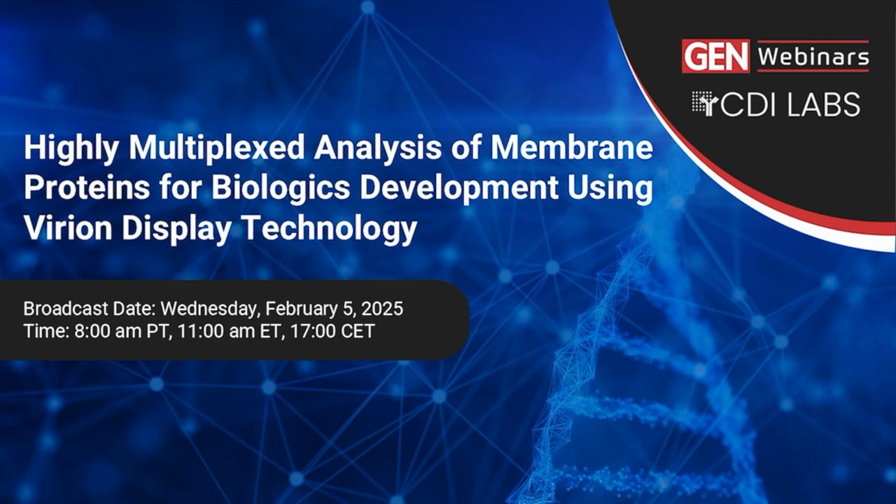Current technologies for studying membrane proteins either involve expression in cell-based systems, which can lead to high background from contaminating endogenous proteins, or purification using detergents or nanodiscs. In both cases, these approaches can result in receptor inactivation. So in this webinar, our speaker will demonstrate the utility of virion-displayed membrane proteins for screening antibody biologics.